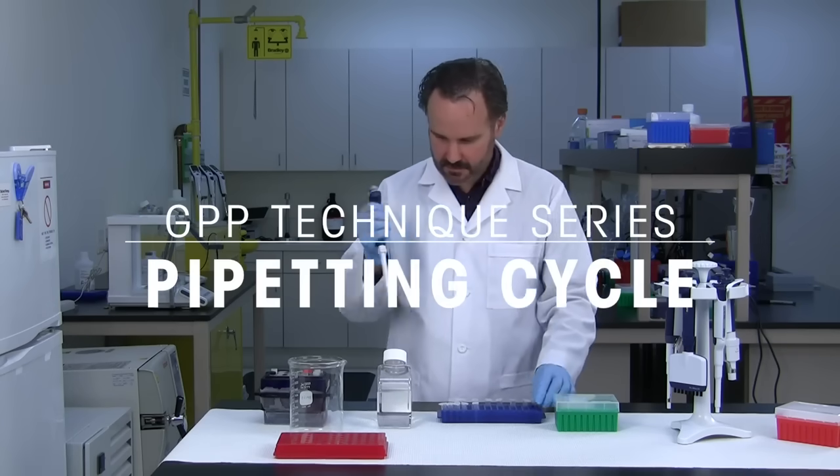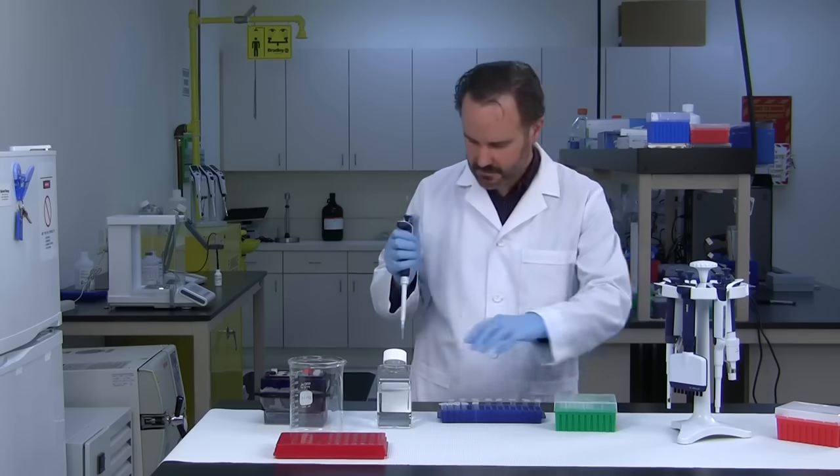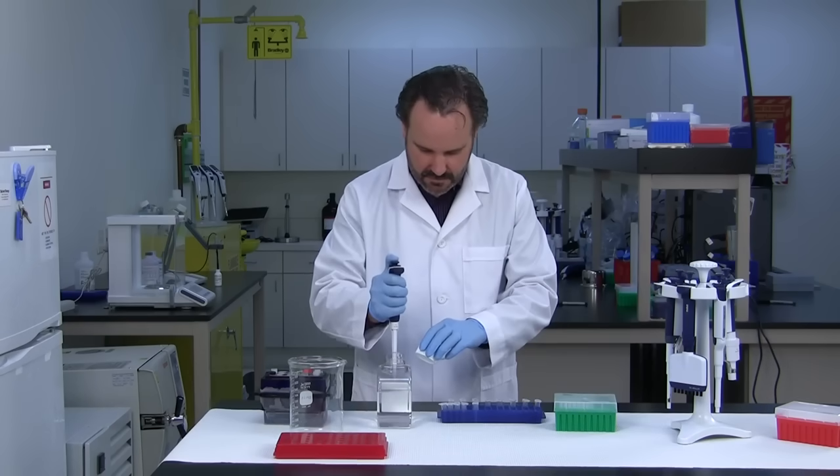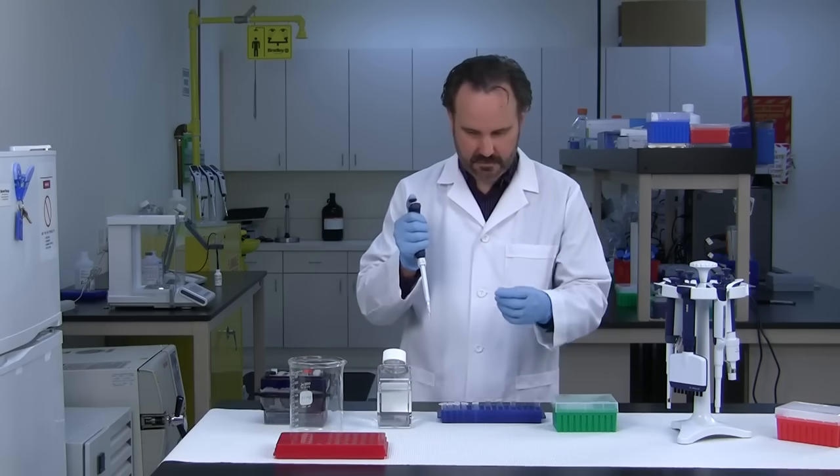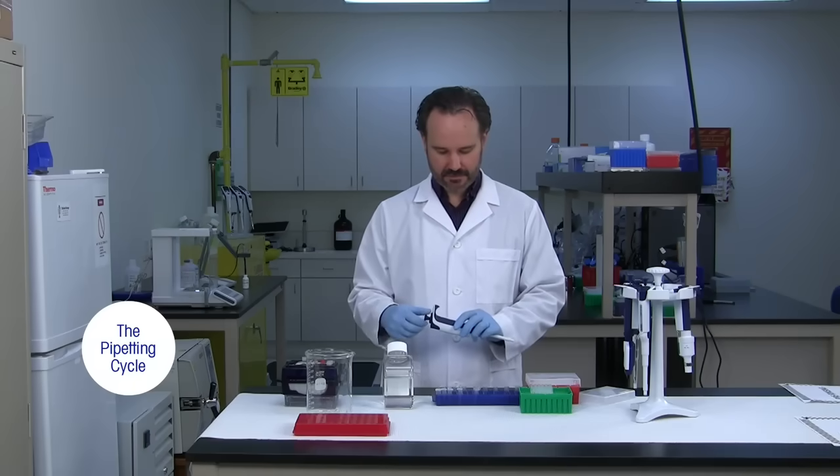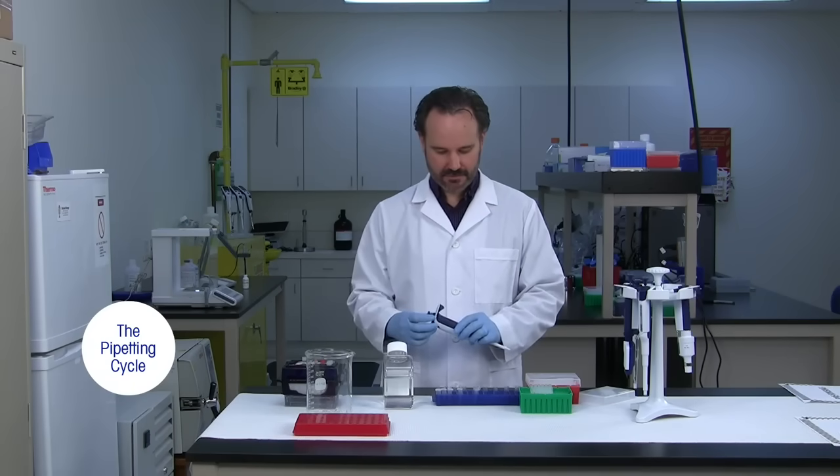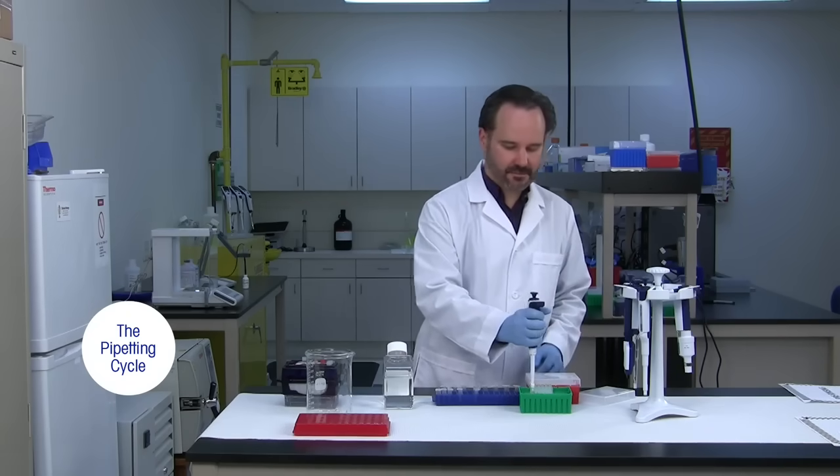Pipetting with an air displacement pipet is a five-step process that's sometimes referred to as forward pipetting. After setting the volume, place the tip onto the shaft or liquid end of the pipet, making sure that it's secure to prevent leakage.